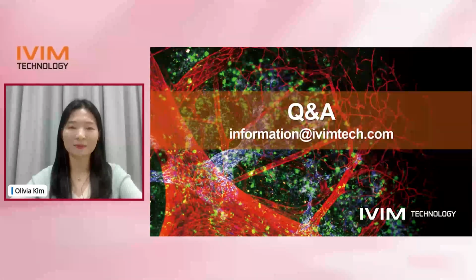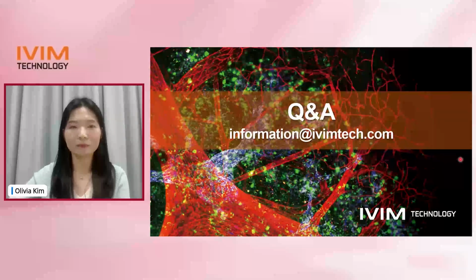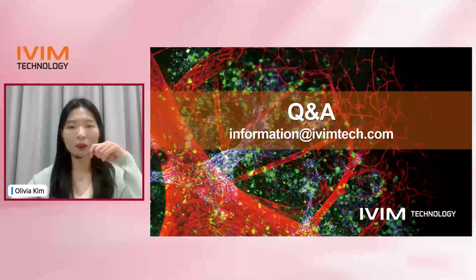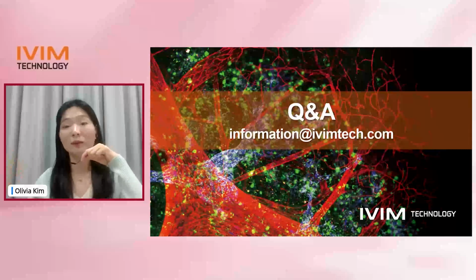And the next question is, how do you label blood vessels or other cells for imaging? Currently, we use antibodies conjugated with fluorescent dyes for labeling, and these are administered via intravenous injection. If there is a specific target of interest, users can conjugate the appropriate antibody with a fluorescent dye themselves. Or if the process is challenging, we also provide in vivo labeling kits that can simplify this step.